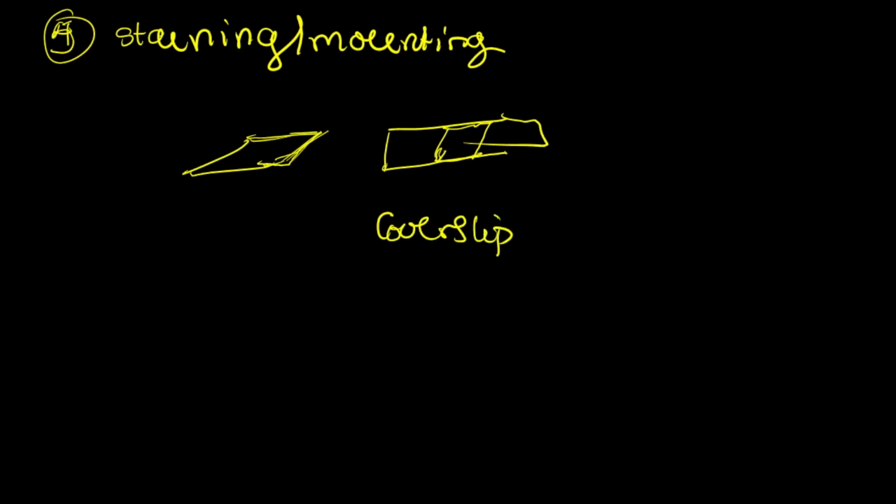Alright, so now we have a tissue slice, and this tissue slice has been cut such that if it were to be studied under a light microscope, light can easily pass through it and there would be no overlapping structures, so we can clearly examine the tissue. Now, however, the tissue components and the cell components have relatively close optical density. Okay, now we are studying this under light microscopy.